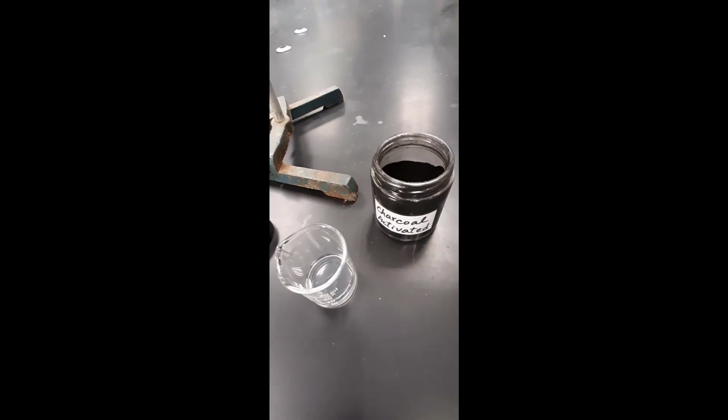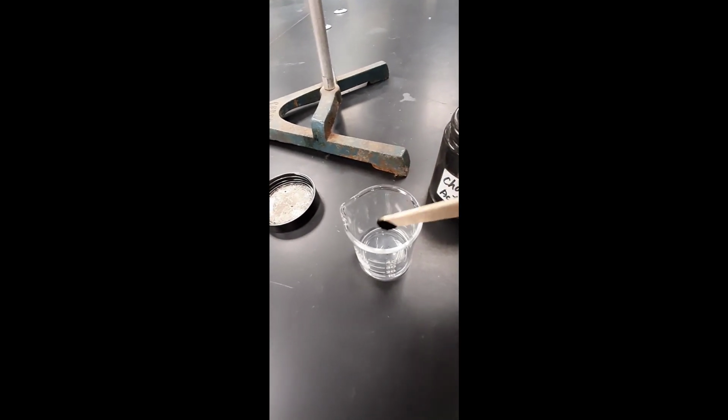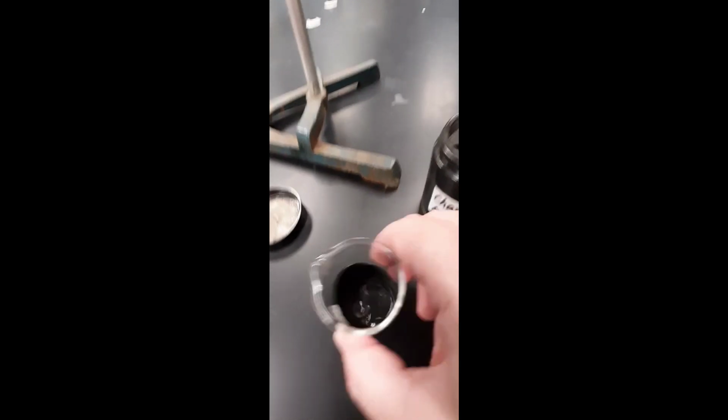I begin by adding charcoal to the remaining solution from Part B. You will notice that the charcoal is fine and very powdery. I then swirl the charcoal to mix it with the rest of the solution.